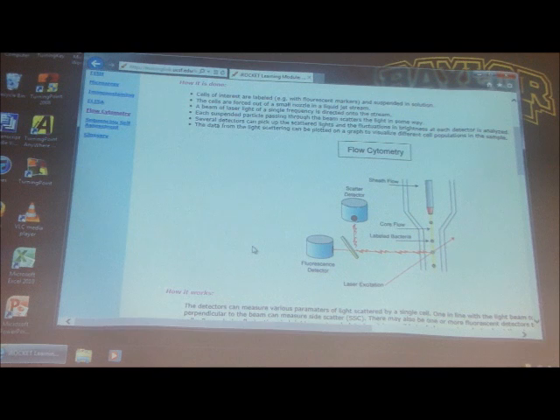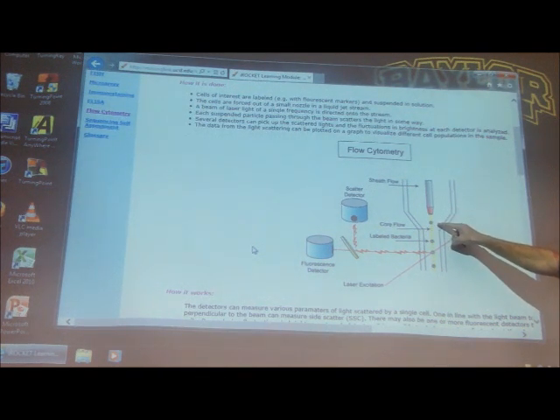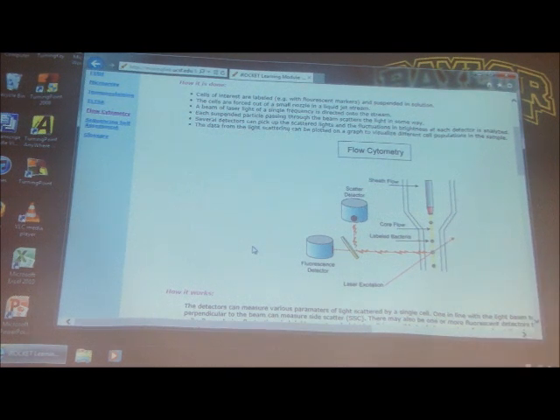You take an antibody against that surface antigen, and then you go ahead and take your Lake Waco water, you add the antibody, and the Salmonella is all fluorescing because it has that antibody on it, a fluorescent antibody. Then you take it and you run it through this flow cytometer, and it individually takes your little bacteria, the individual bacterial cells, and it puts them in individual droplets. So one bacterium per droplet.